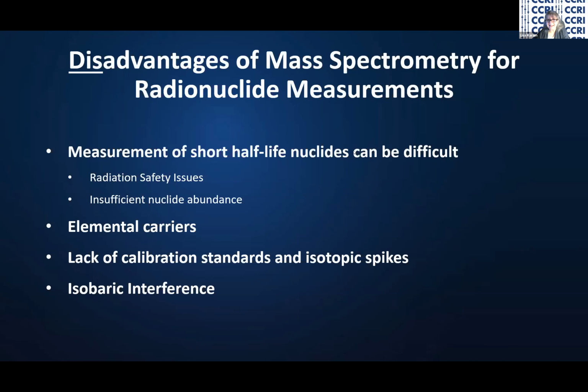During the discussion, I thought the perfect technique to develop would be live time mass spec. So basically you can see the decay curve as the source is decaying away. Of course, you can do that, but it's always a kind of step function. I don't think you can actually follow the decay curve. Or is there a lifetime mass spec technique available?